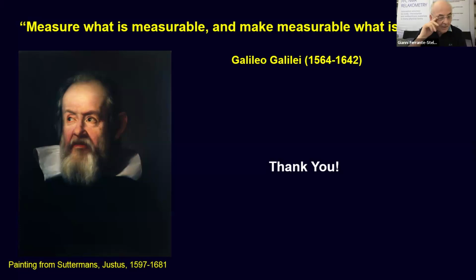Sure. But something more, Esteban. You know that good results are also related to good experimental parameters. Sure. You have to set correctly all acquisition parameters related to the time window you want to explore, number of fields, number of tau, and so on. Did you make some preliminary check about this set of parameters?